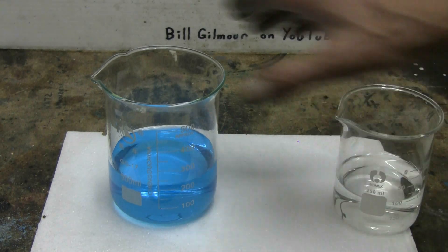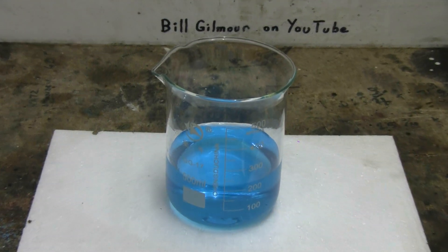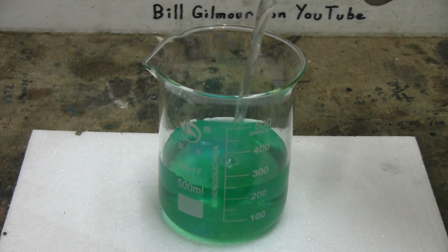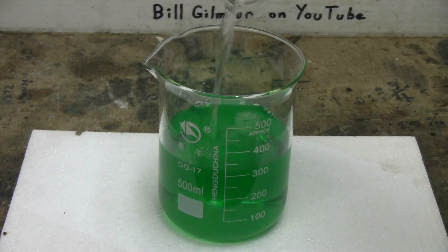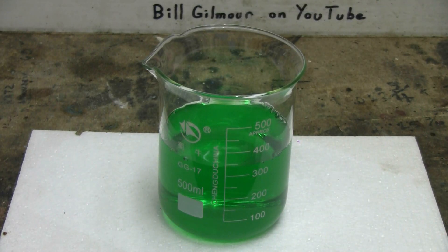There'll be a color change when I add the sodium metabisulfite to the copper sulfate. With the two added together, the solution turns a beautiful bright green color.